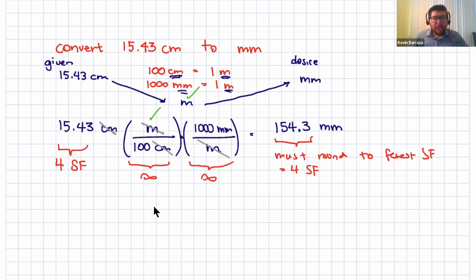So just to reiterate, are you using the ruler correctly and writing the digits down correctly? That goes back to our lab lecture number 1. That was all about that, if you'd like to go and look at that again. Secondly, you'll be doing conversions. I'm going to look that you're using the table that I gave you and not just Googling numbers. And third, I'm going to be looking for that you're rounding correctly.